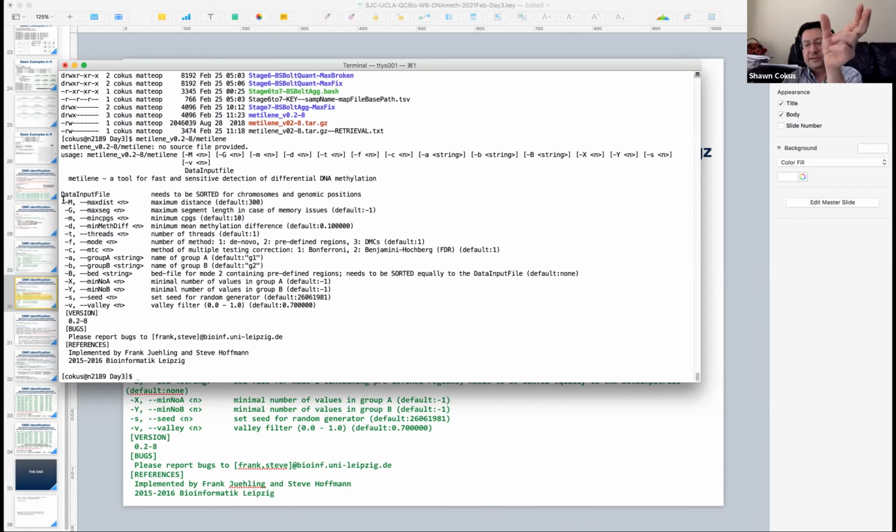So it's bigger. Essentially, once it gets its foothold on a region that looks different, it optimizes the edges to try to get the best edges for where the region gives you the most difference in the test. It basically walks along the genome at a certain tiling, and when it finds a candidate region, it then optimizes the partitioning and so on, and just walks along and optimizes as it goes.